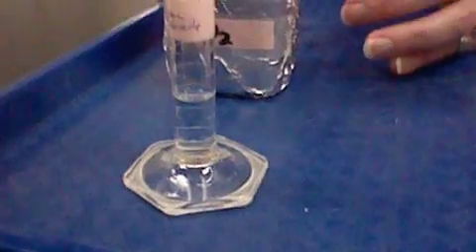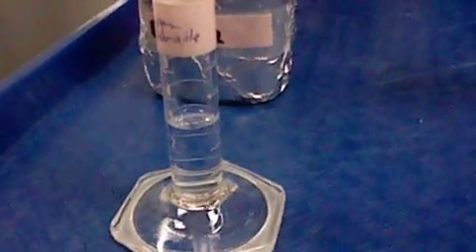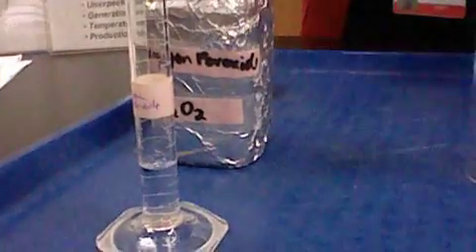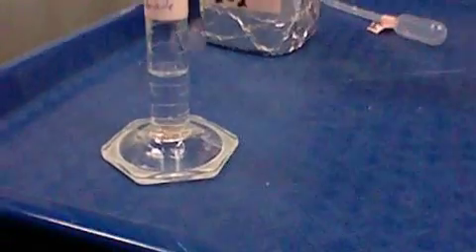Tell me when it's at 3. You other guys can help them too. Tell them when it's, say, that's it. Okay, so let's put that back in here and I'll squeeze it. Yeah, I think that's exactly it. Okay. All right, now this is the hydrogen peroxide and this was the luminol.